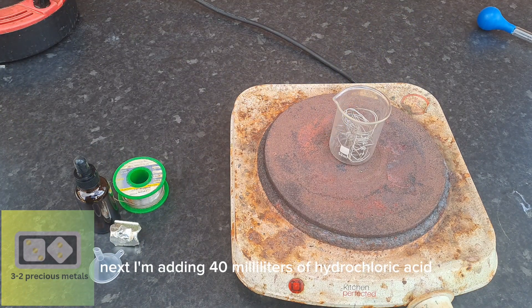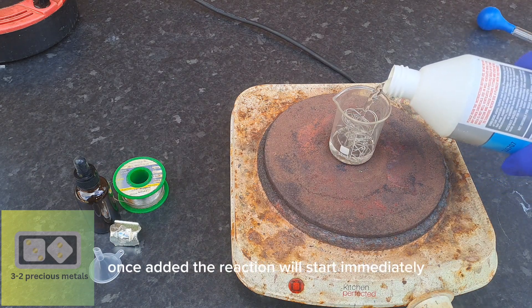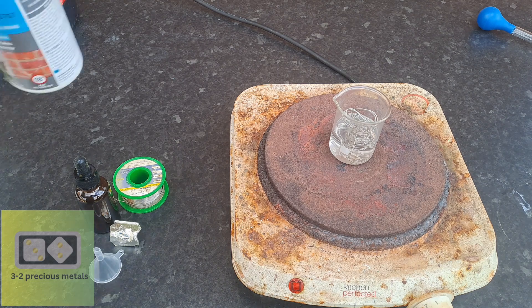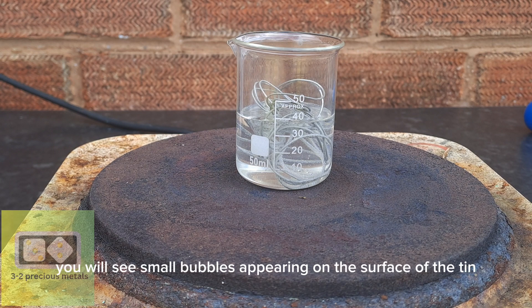Next, I'm adding 40 milliliters of hydrochloric acid. Once added, the reaction will start immediately. If you look closely, you will see small bubbles appearing on the surface of the tin.